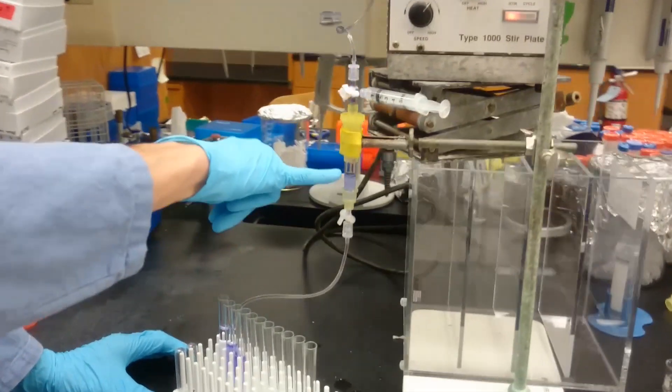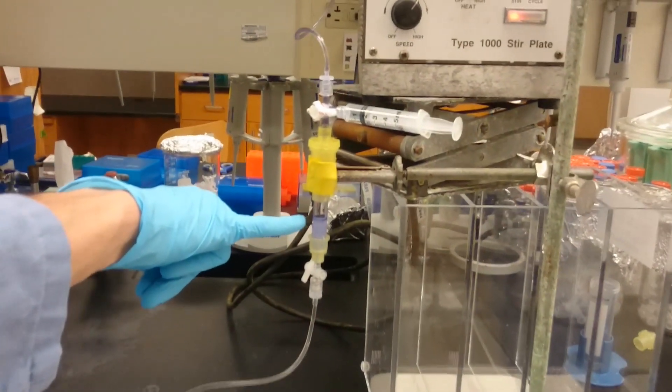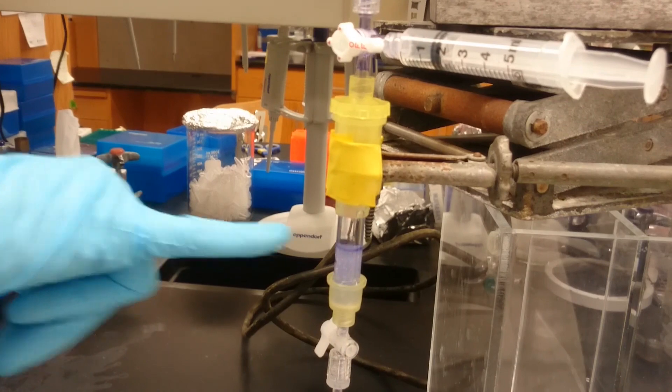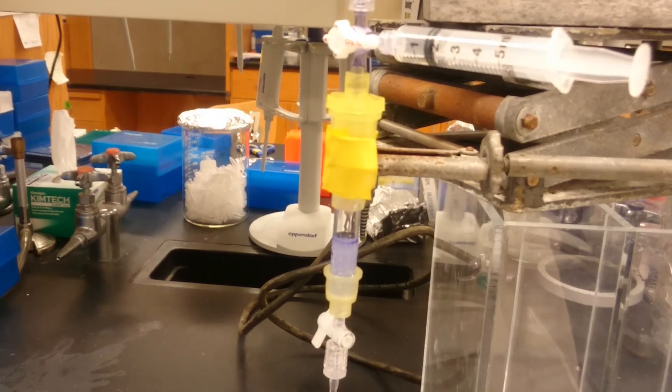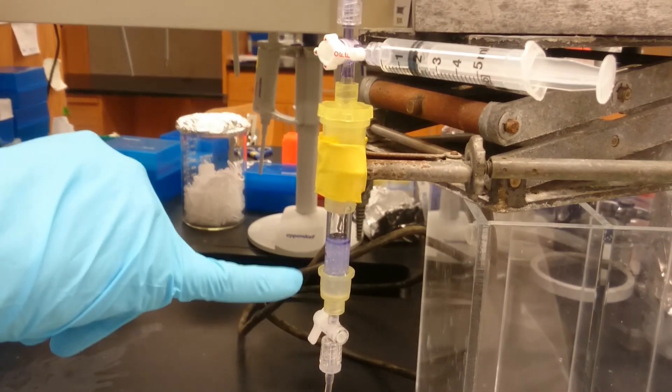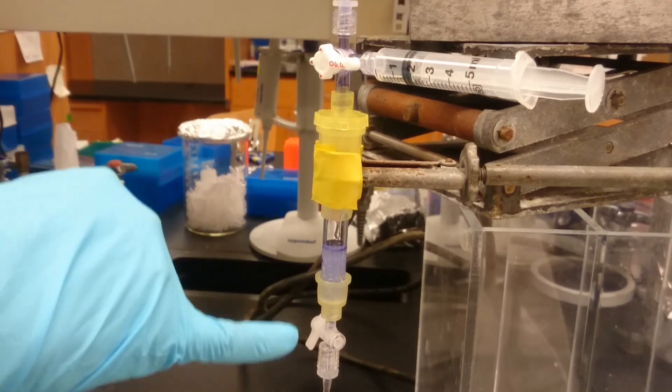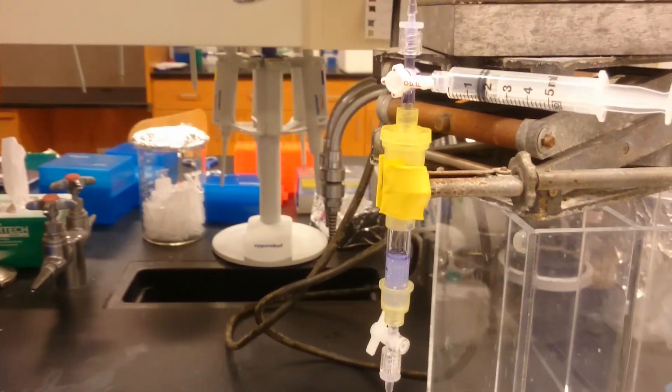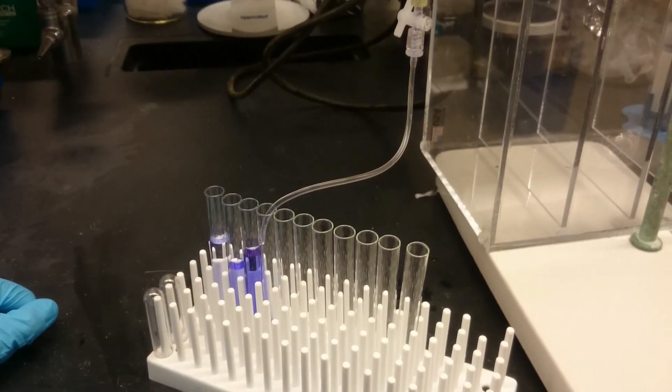And if you take a look down here, you can see that I've got this going at a pretty good clip. Your column will probably not run this fast. I'm using glass beads, like I said, just for demonstration purposes, but a real resin would probably have more resistance than this and it would flow a little bit slower. But overall, you get the idea.